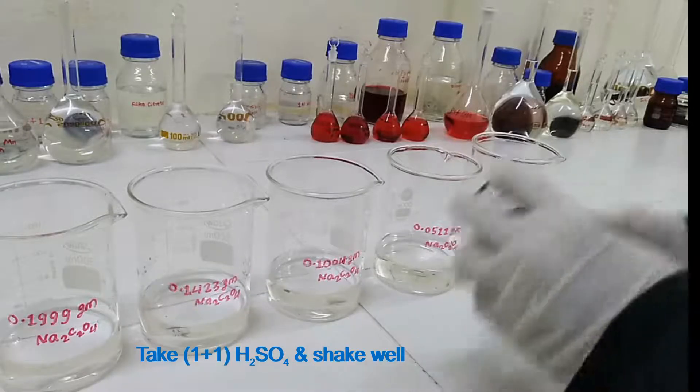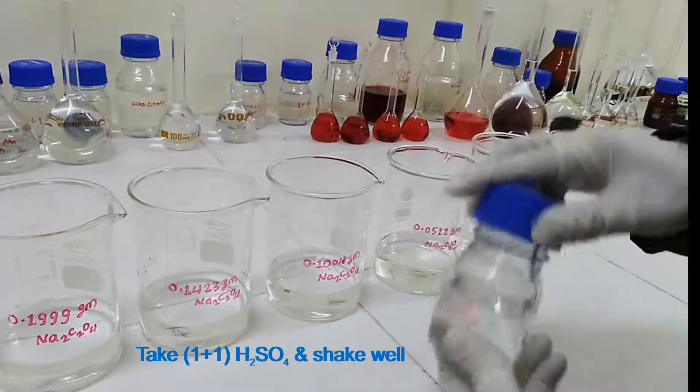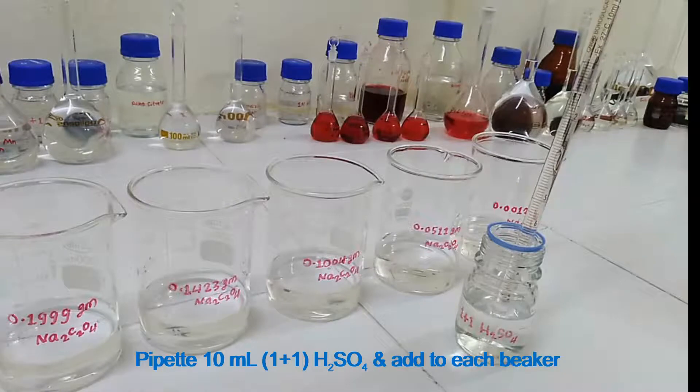Then take 1+1 sulfuric acid and shake well. Add 10 ml of 1+1 sulfuric acid to each beaker.